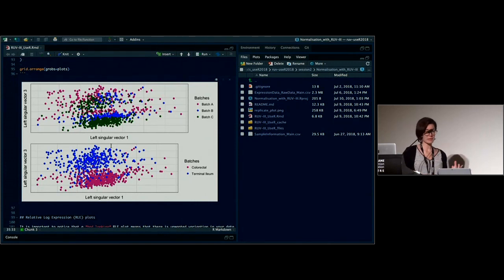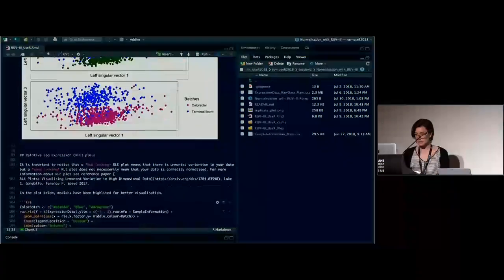They are split by tissue, but within every tissue there is also a split by batch, which means that there is still batch effect that we need to correct for. It might not be that striking from the first PC, but you need to take it into account, because this will create confounding later if you try to do any other analysis or plots.